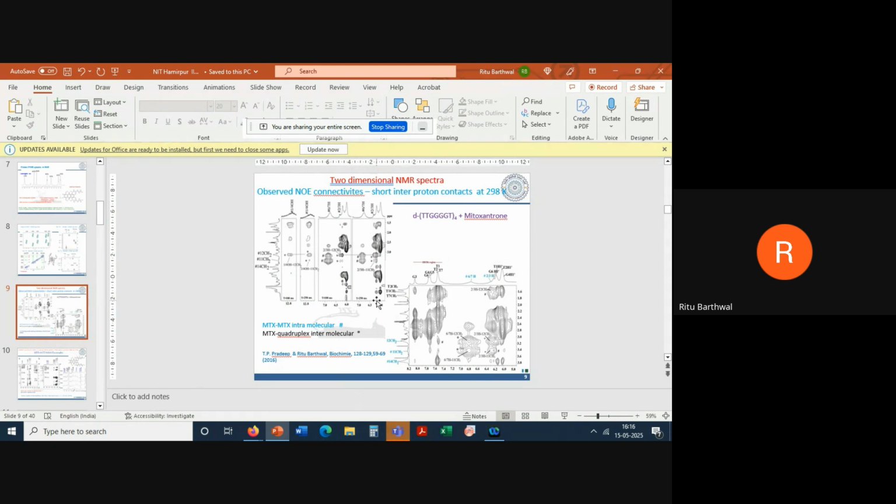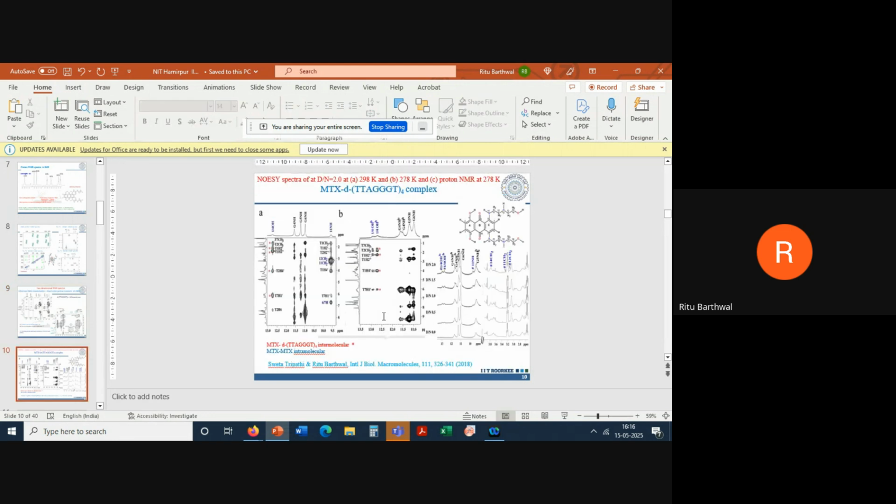See here, in this fourth. On the right hand side, where I put this, it's a big peak, smaller, this is still smaller and this is still smaller. This means the proton here is away from this proton at a larger distance or smaller distance. We have exact methods to calculate the distances. So these distances we will calculate. We will calculate conformational angle, and so we are doing the structure basically.